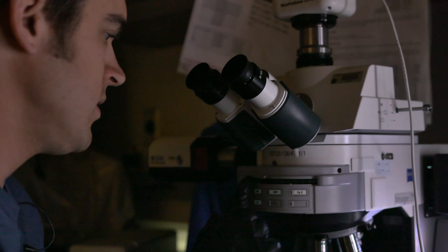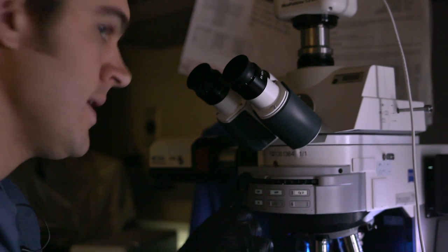So that's looking really good. Switching back over to the GFP filter number two here. And on the video screen, you can kind of see that background fluorescence. But let's move around and see if I can find any. See if there's any. Oh, there we go. That just might. It's a little brighter. Oh, it's showing up on the screen nicely. Actually, it's showing up better on there, I think, because I've got the filter open for the camera. But that looks like what I want right there.